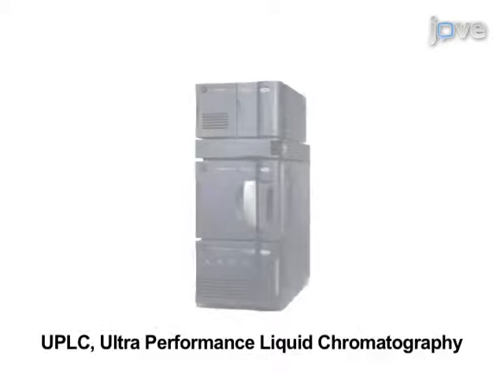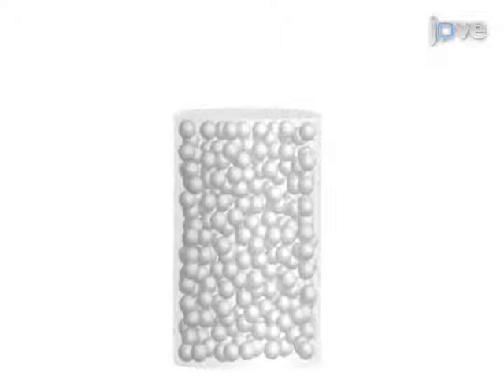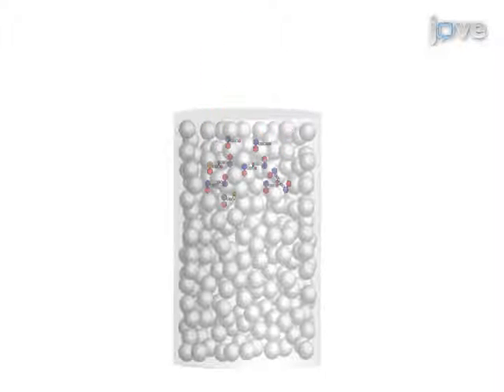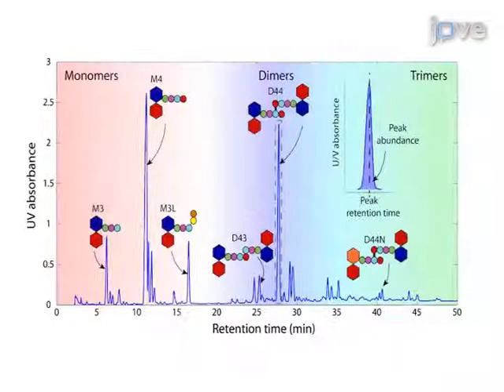Ultimately, UPLC is used to separate muropeptides according to size and hydrophobicity, facilitating the quantification of important cell wall characteristics, such as degree of cross-linking and average glycan strand length. This method can help to reveal the answers to key questions in the field of microbiology, such as the relationships among morphogenesis, cell wall architecture, immune system activation, and pathogenesis.